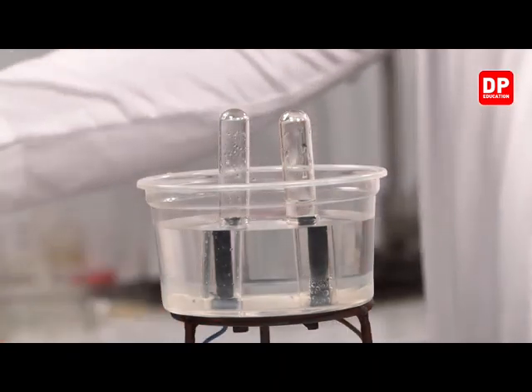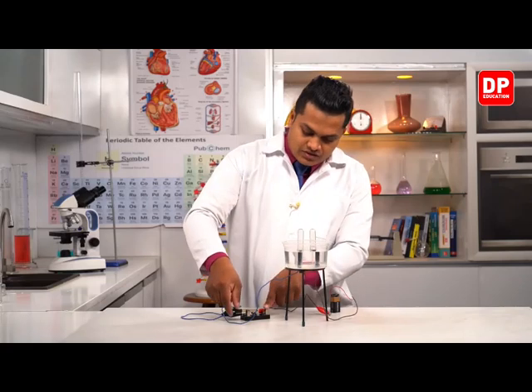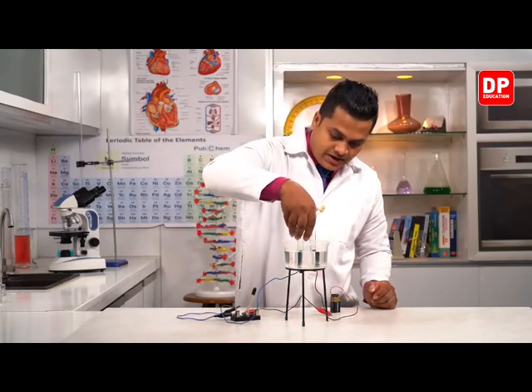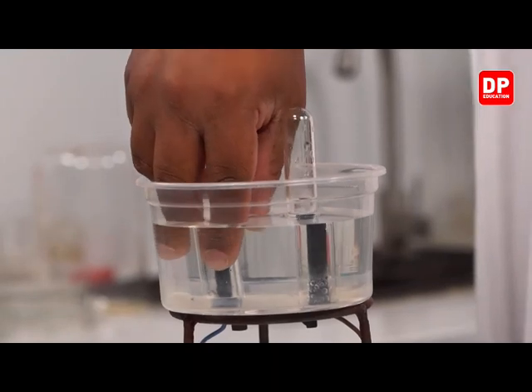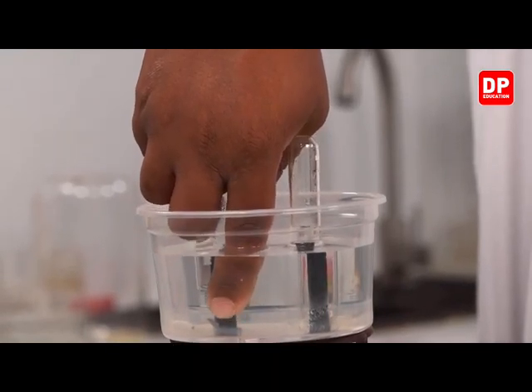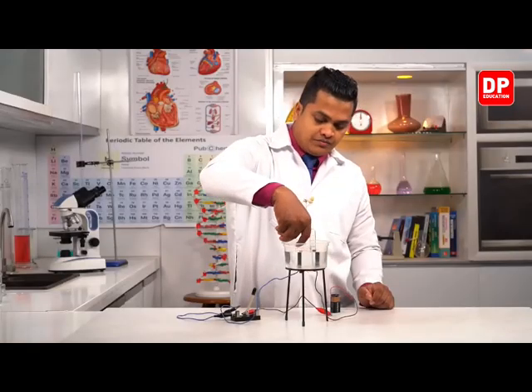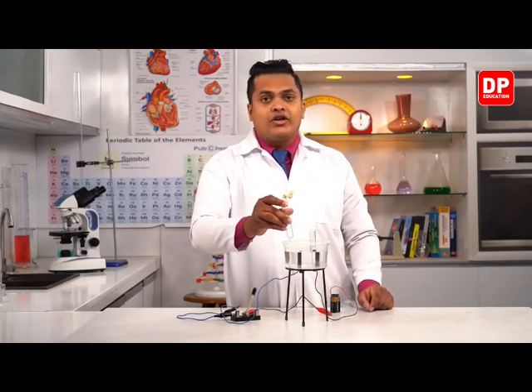Now what I'm going to do is safely turn off the switch. We have to turn off the switch first of all. So now I'm going to safely dip my hand within the solution, and keep the finger beneath the tube. Right now, this is the gas which is at the negative terminal.